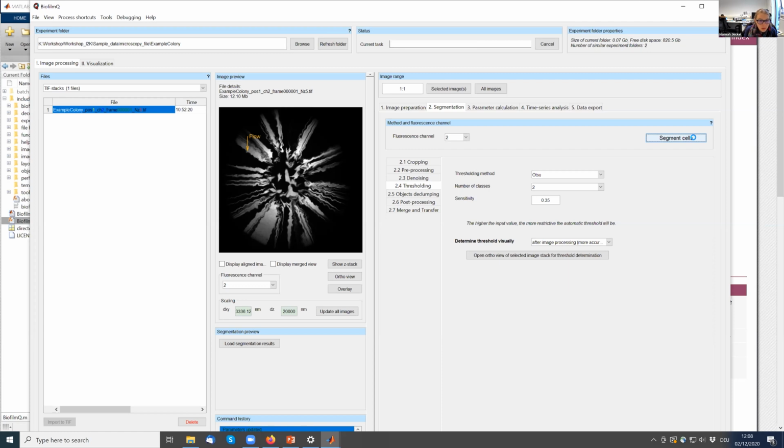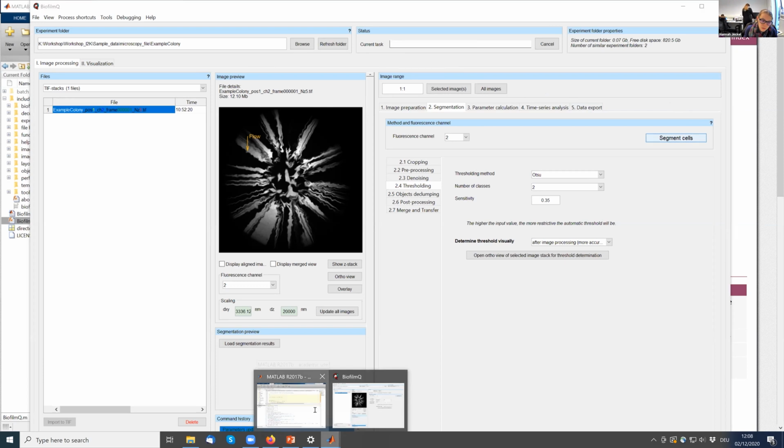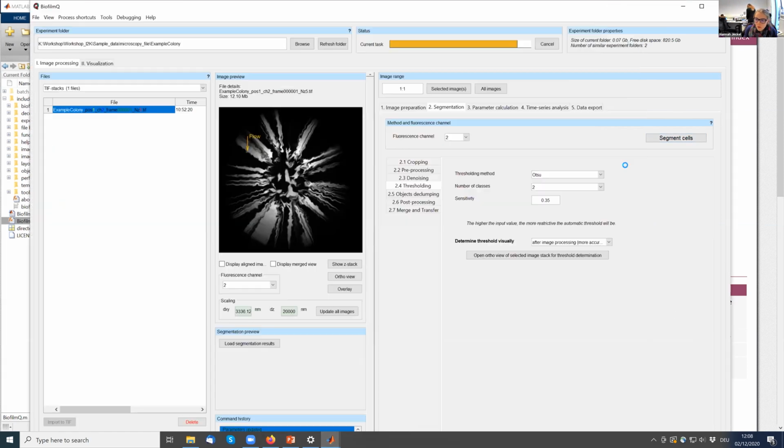Okay, looks like the segmentation has finished, which means that we can now actually still have a waiting sign. Just looks like it's finished. I don't really know why. Oh no, okay, I was too impatient. All right, so now it has finished, and we can do the merge.